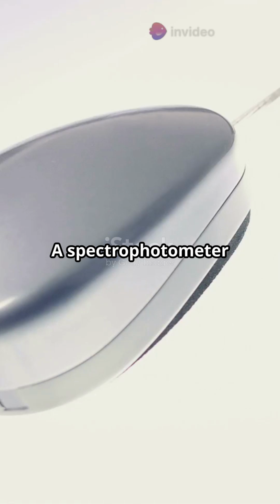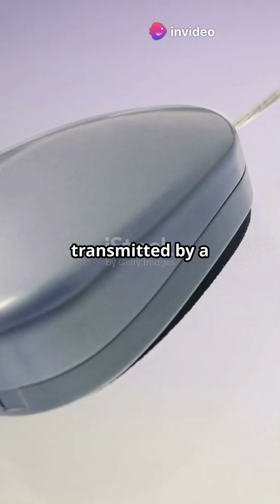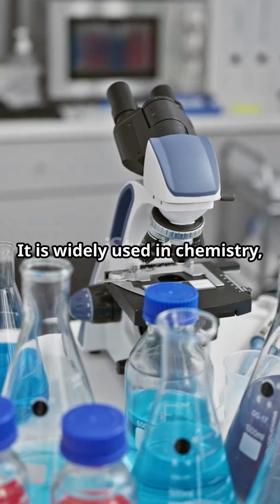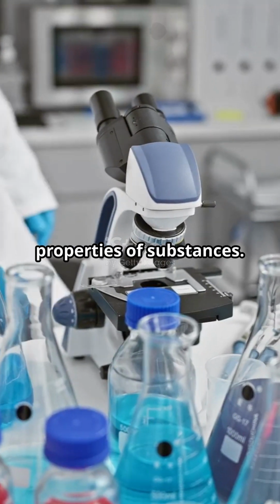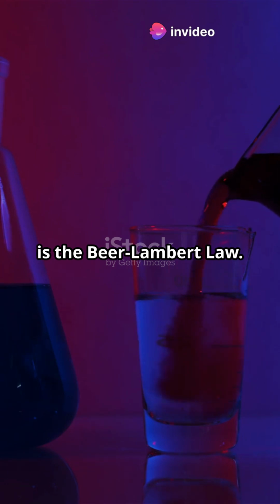A spectrophotometer is an instrument used to measure the intensity of light absorbed or transmitted by a sample as a function of wavelength. It is widely used in chemistry, biology, and material science to analyze the concentration or properties of substances. The principle behind the spectrophotometer is the Beer-Lambert law.